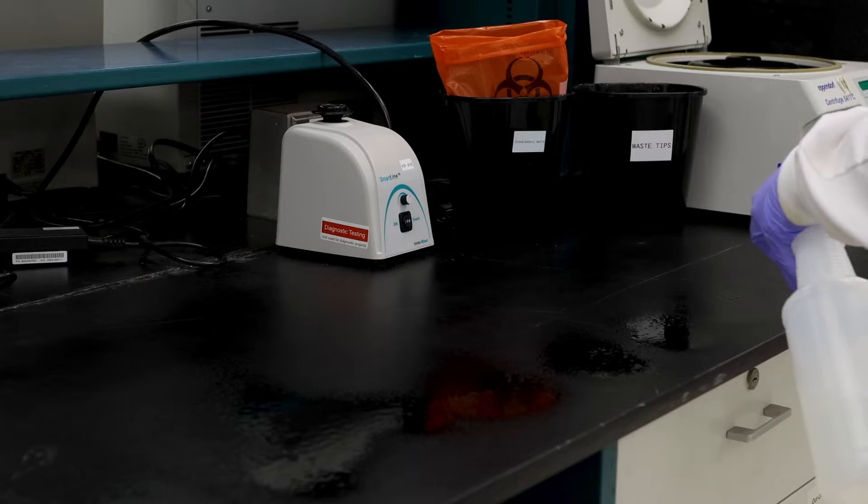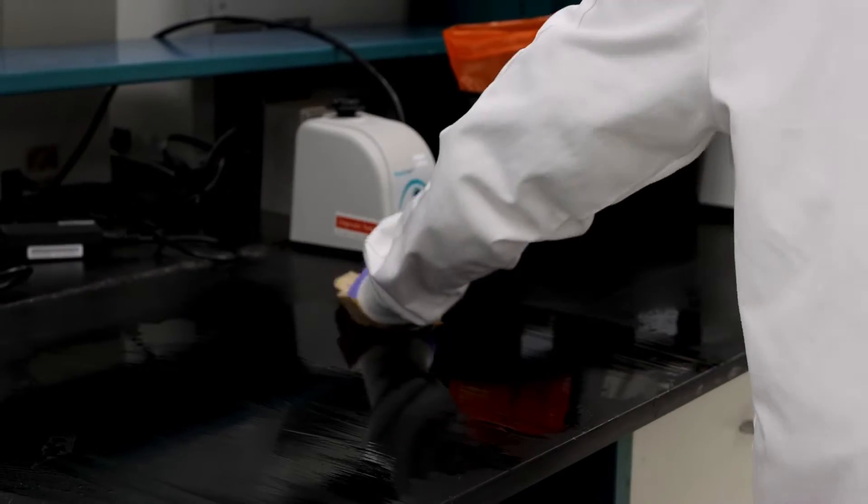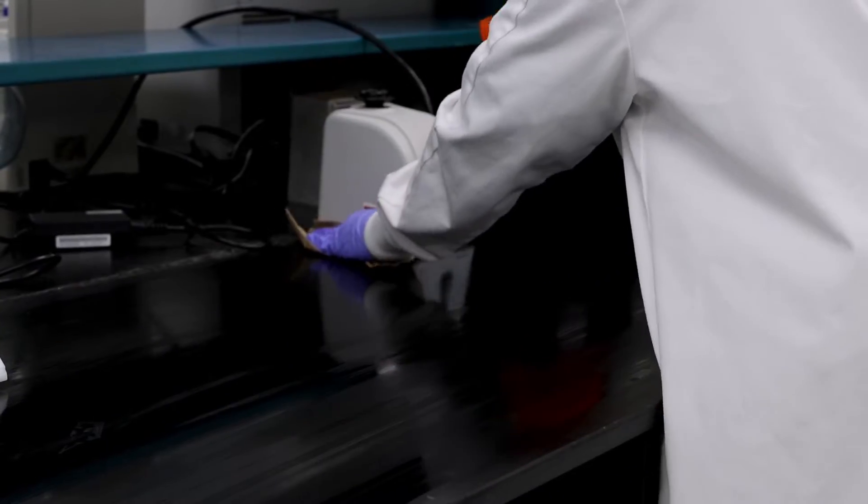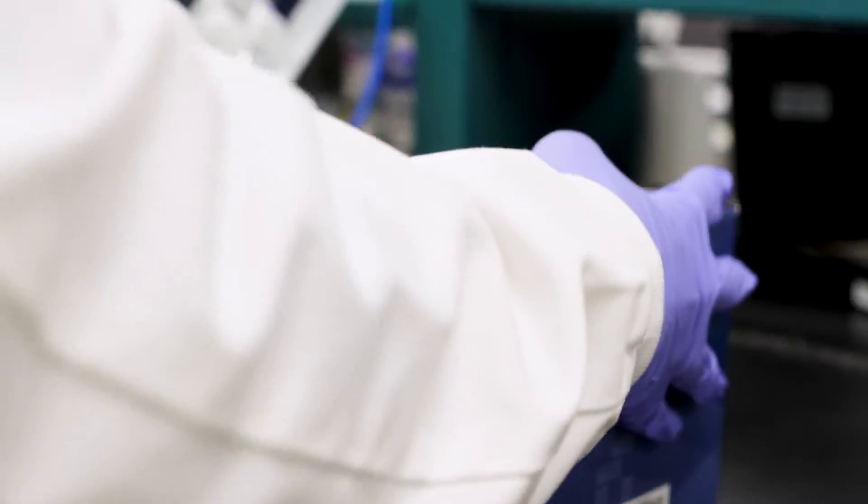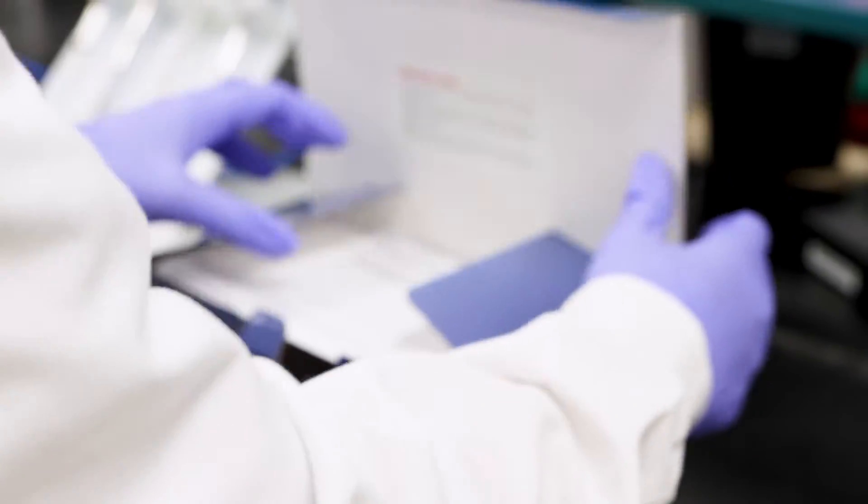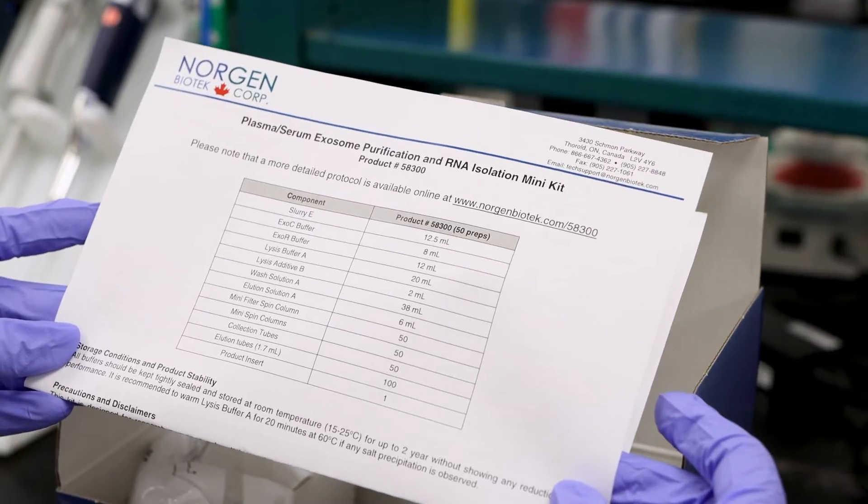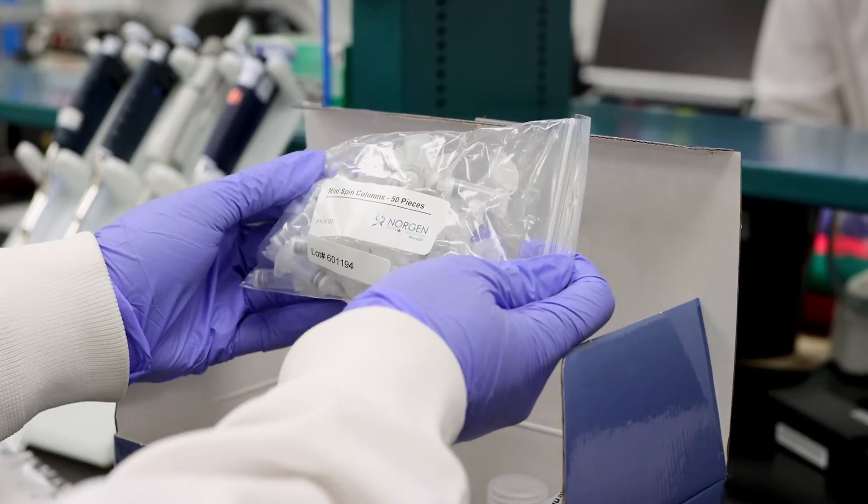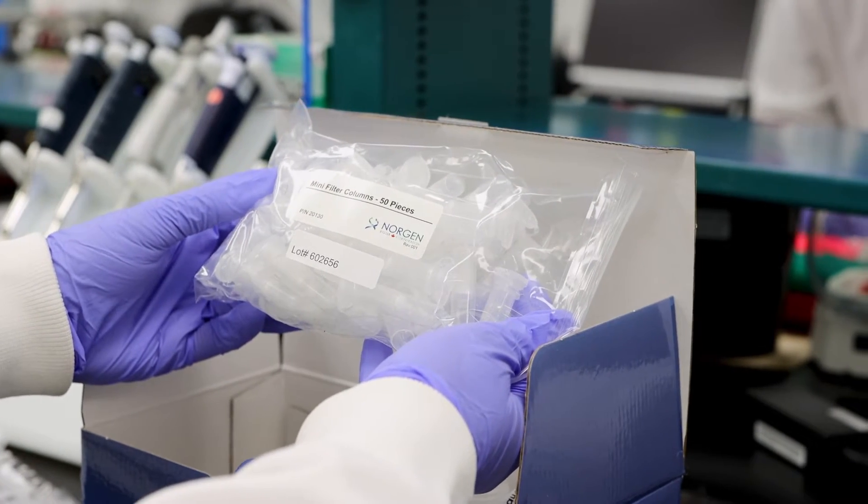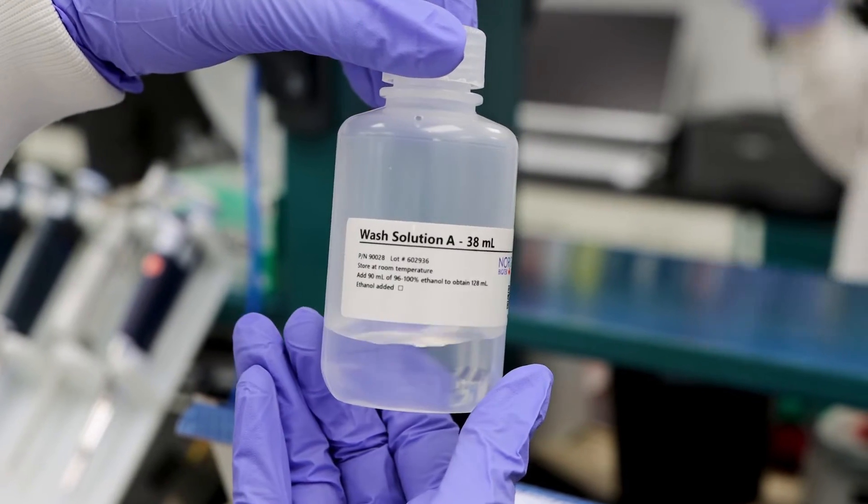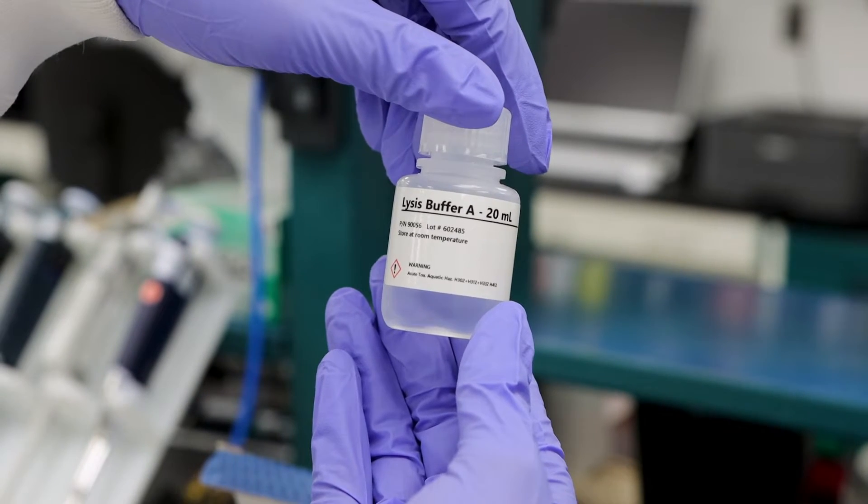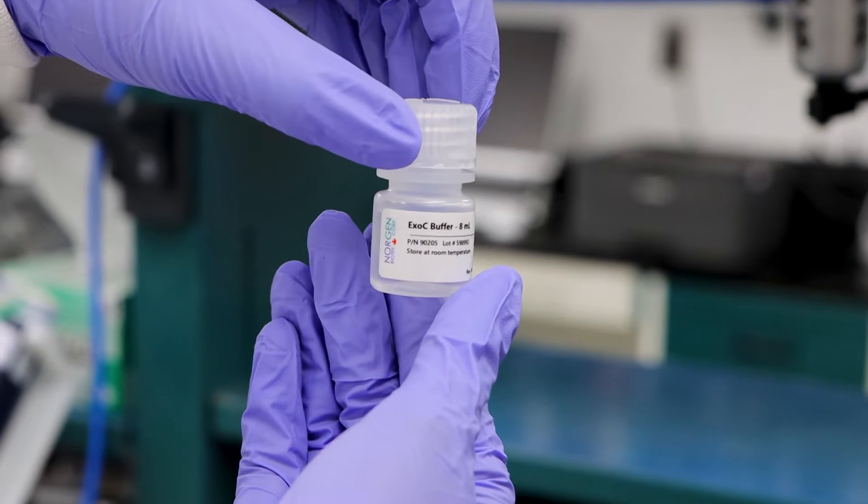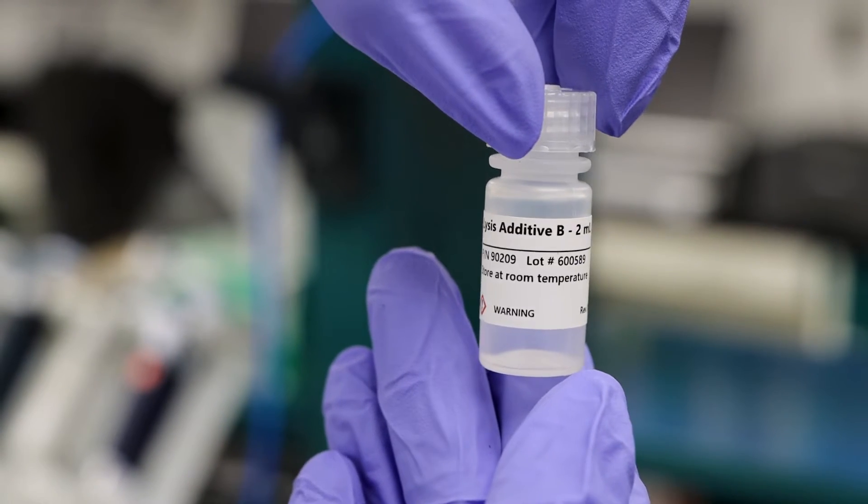As always before you begin, sterilize your workspace and instruments with 70% ethanol followed by 1% bleach. Upon opening the kit, you will find a detailed product insert, 1.7 ml elution tubes, mini spin columns, mini filter spin columns, wash solution A, slurry E, lysis buffer A, exo R buffer, elution solution A, exo C buffer, and lysis additive B.